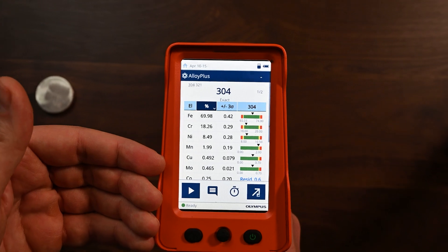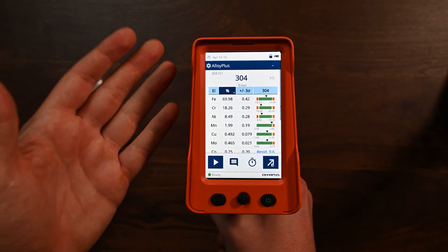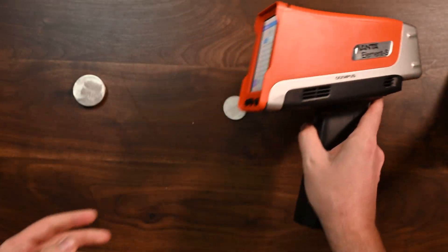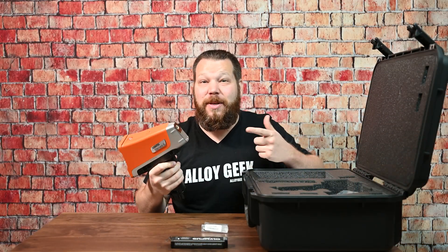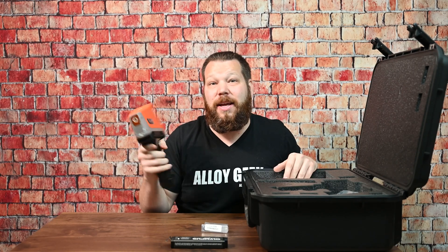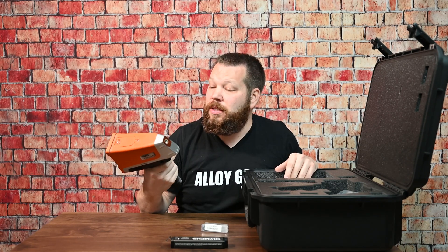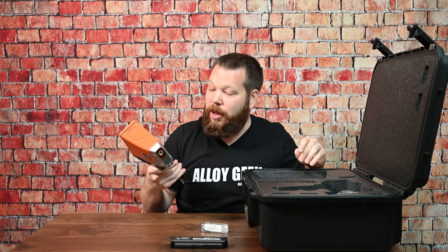But this elongated display — the way it's bright — I just think this is a really nice design by Olympus. As you just saw, the Olympus Vanta Element S is a nice little analyzer — really sleek with a lot of nice features. I think this analyzer is a really nice workhorse. Olympus is known to have their customer service right here in the USA. You can call someone anytime and talk to somebody, which is really helpful. That's not true for everyone in the marketplace.